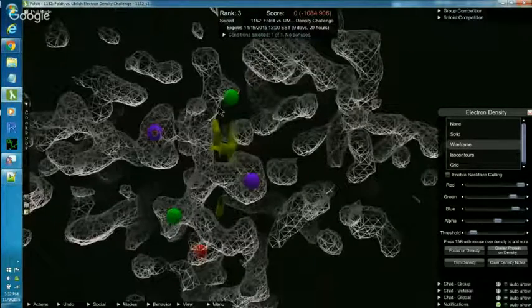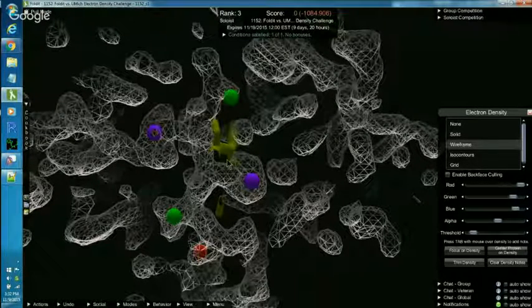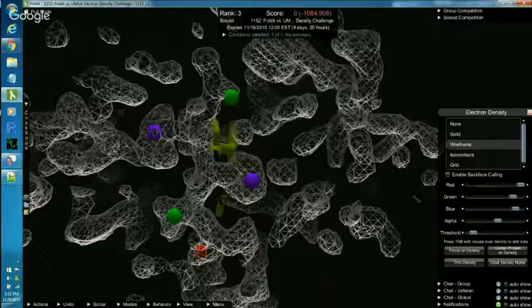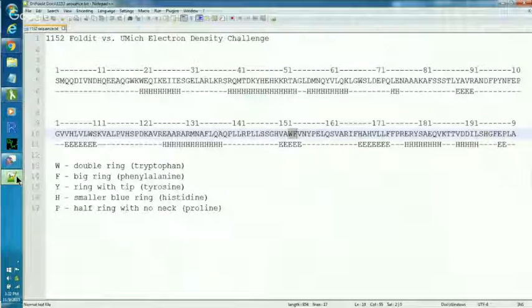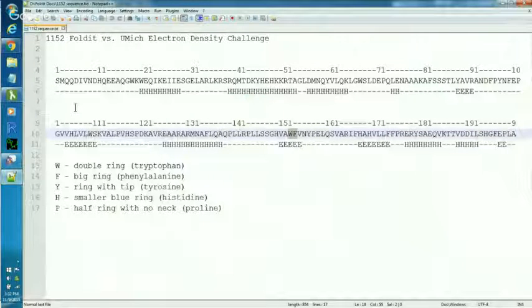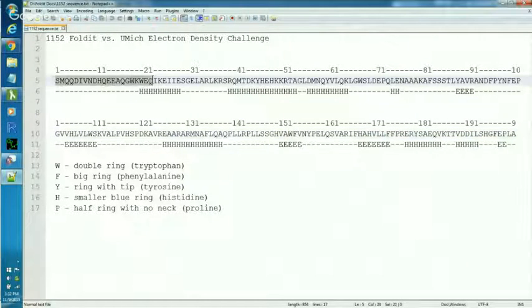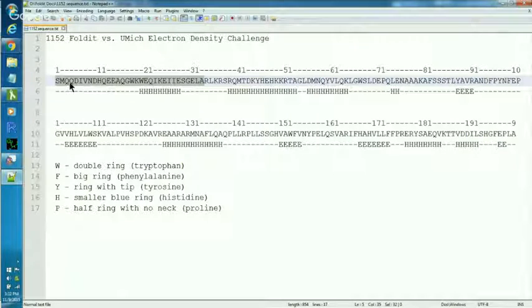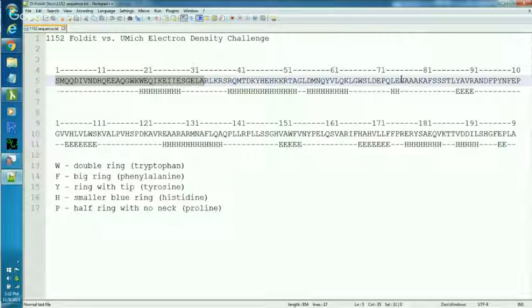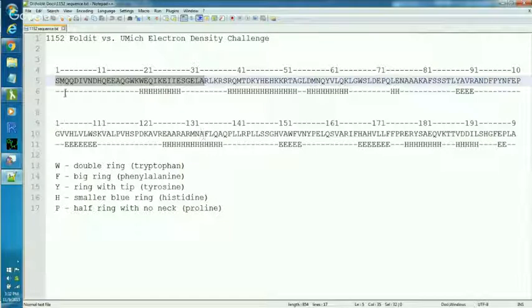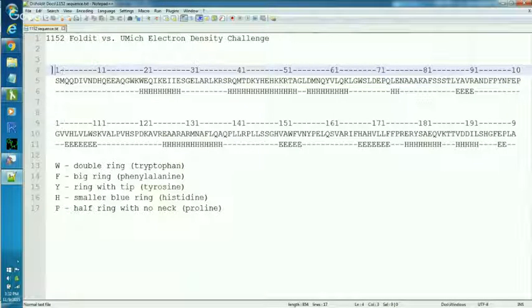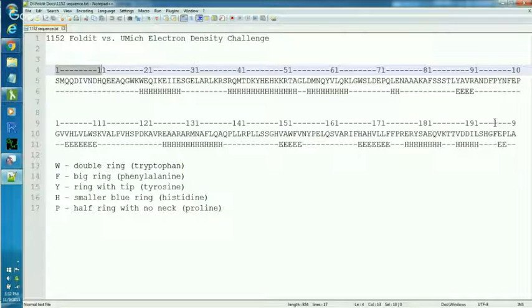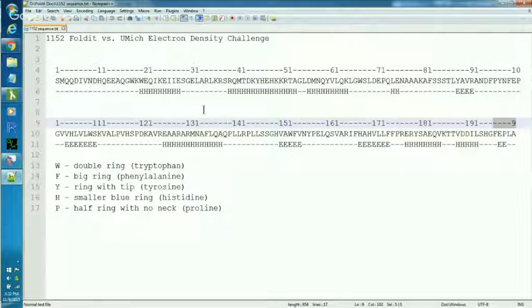And I'm going to flip now over to a text document that I use when I'm working on an electron density puzzle. I went to the puzzle page on the website and I got the sequence. That's the list of letters that stand for the amino acids in the protein. And since this is a long protein, I broke that sequence up into two lines and I put it in my text document. Then above the sequence, I typed in the segment numbers going from 1 all the way to 199. And those are going to help me find things in the protein.